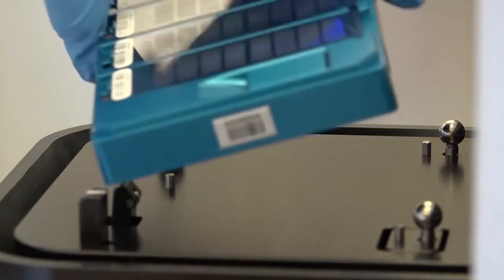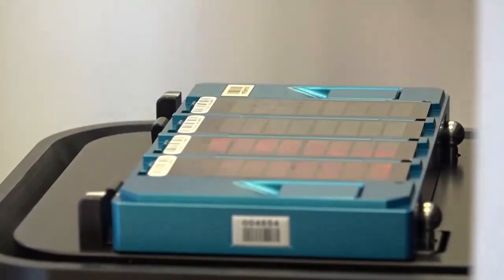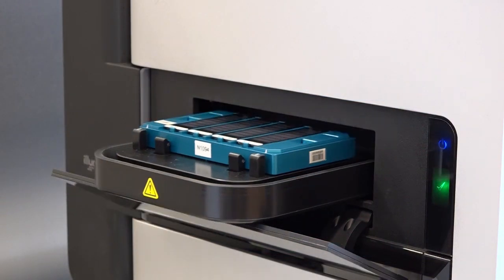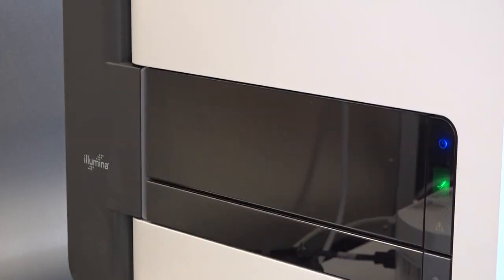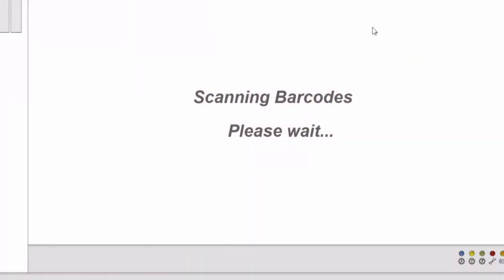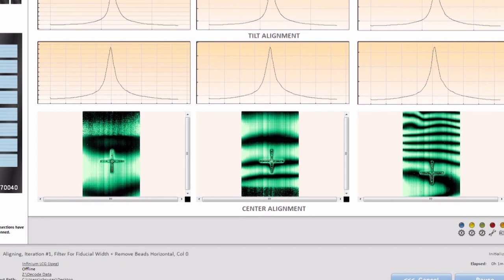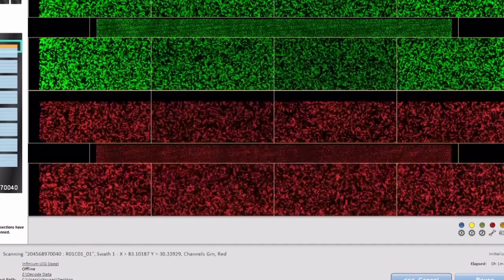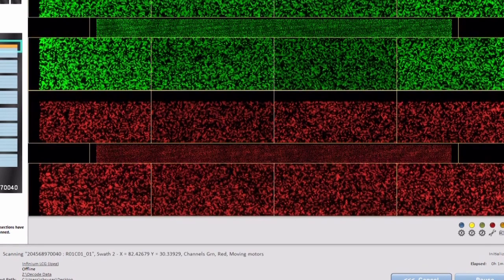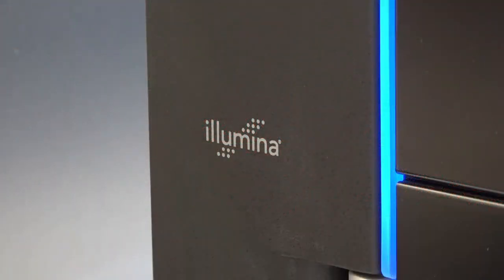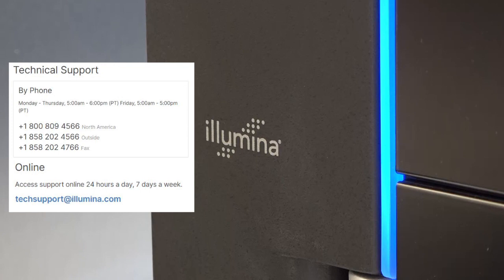Place up to four bead chips at a time into the Illumina scanner. Barcodes will be read automatically, and once decode files and output paths are defined, scanning will begin. Whole genome genotyping data will be extracted from images collected from the Illumina scanner in downstream analysis. For questions concerning best practices or lab techniques discussed in this video, please contact Illumina Technical Support at 1-800-809-4566 or at techsupport@illumina.com.